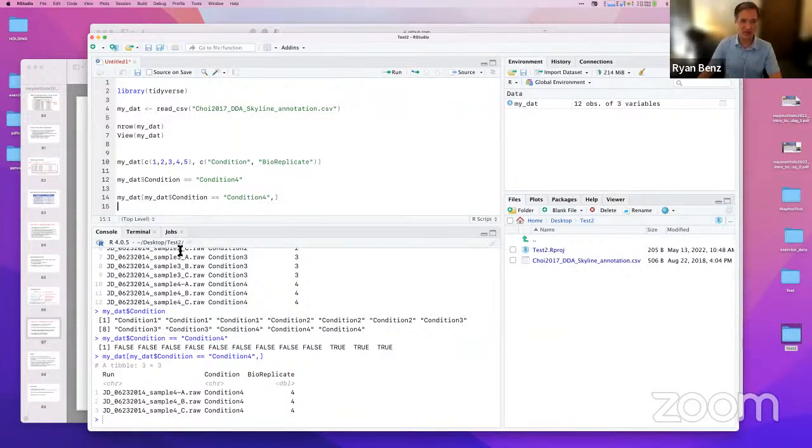All right, so that was quite a bit of code here. I have to admit, a little bit complex, but we've learned all of the individual pieces to make this happen here. And so I bet you could now think of a way to read a protein table into R that you have with your own data. And I could probably imagine you being able to, with some of these examples, and maybe going back and looking at some of the examples, take your table and filter that table to get peptides and proteins that have a false discovery rate of less than 1%, or have a mass to charge ratio bigger than some value, or some peptides that elute in a given elution time in your gradient. All right.